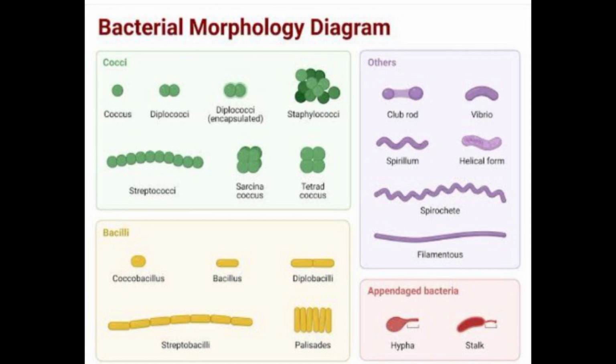Wash in tap water. The stained smear is decolorized with 20% sulfuric acid and washed with water. This step should be repeated till the pink-red color stops coming out. In case of leprosy bacilli, 5% sulfuric acid is used as Mycobacterium leprae is less acid-fast. Another alternative for decolorization is acid alcohol, 3 ml of HCl and 97 ml ethanol. The smear is counterstained with 2% methylene blue for 1 to 2 minutes. Malachite green can also be used as a counterstain instead of methylene blue. Wash with water and air dry.